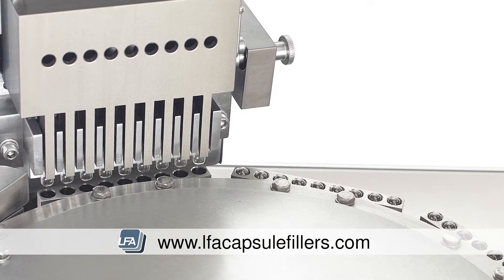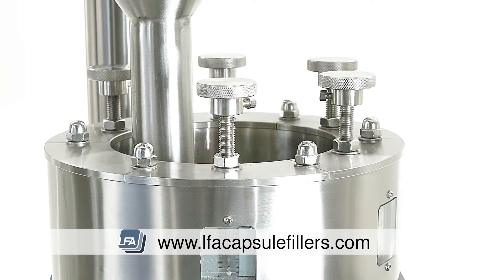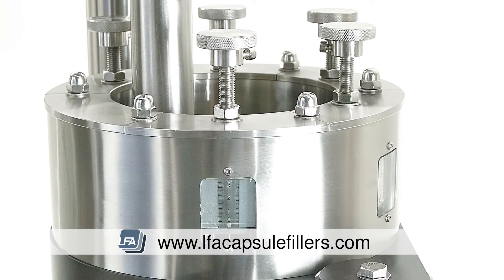The tools you will need for this are a 19mm spanner, a 17mm spanner, a 10mm spanner, and a 5mm allen key.